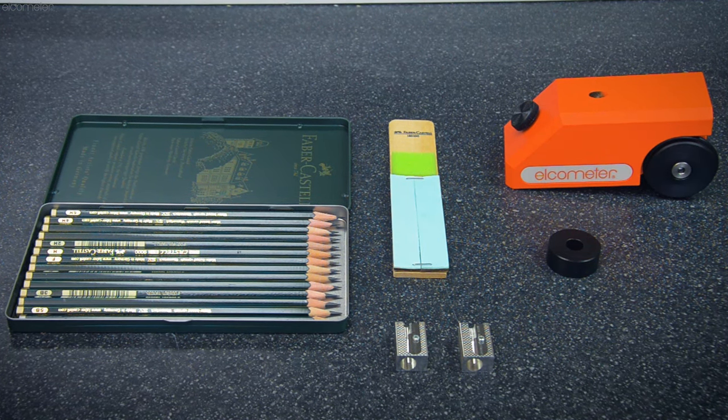So, how do you complete a test? Please note: while this video is a guide on how to complete the Pencil Hardness Test, certain test methods and standards differ slightly on how the method should be completed and how the results should be recorded, so we recommend you always refer to the test method or standard you're working to directly before testing.